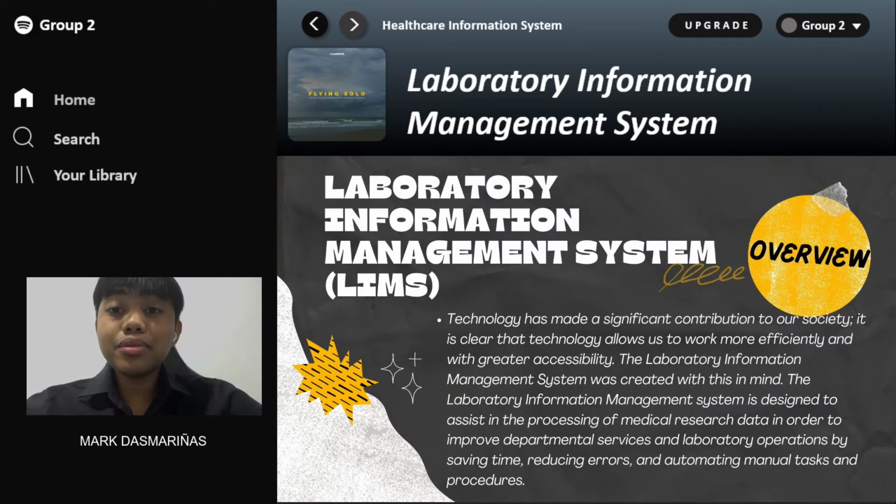An overview of the Laboratory Information Management System. Technology has made a significant contribution to our society. It is clear that technology allows us to work more efficiently and with greater accessibility. The Laboratory Information Management System was created with this in mind. It is designed to assist in the processing of medical research data in order to improve departmental services and laboratory operations by saving time, reducing errors, and automating manual tasks and procedures.